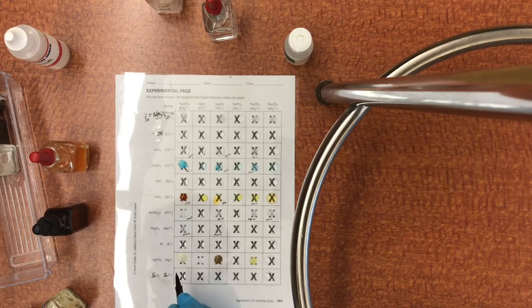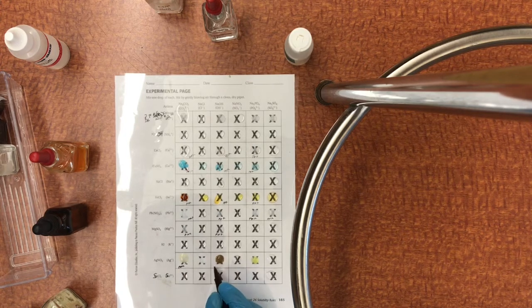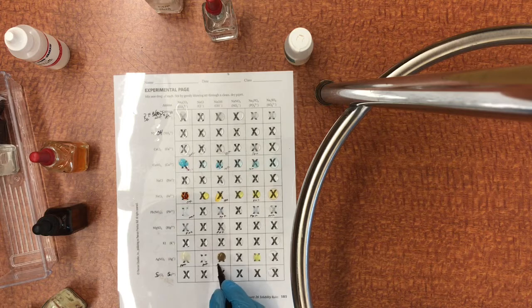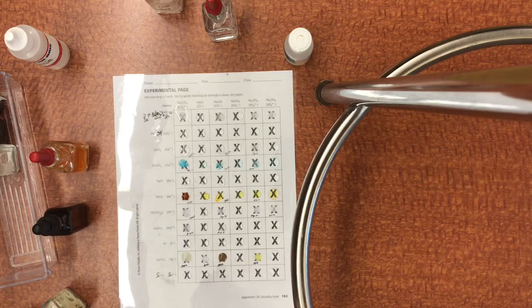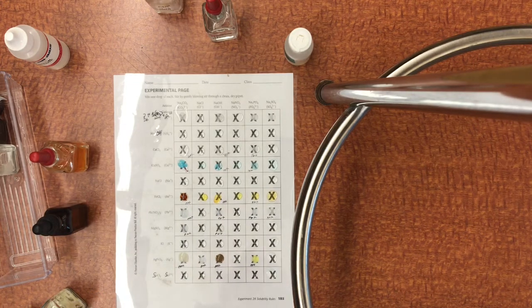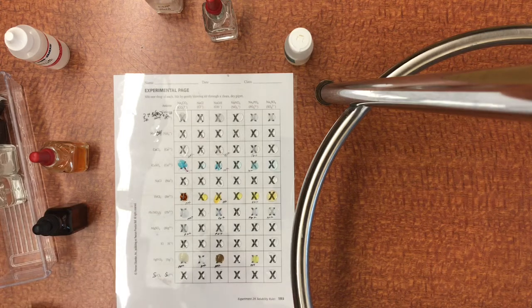So these different solids, they actually will deflect light in different ways or interact with different photons and they'll become colored crystals. So a lot of different ways that color can come in crystals. That's really beyond the scope of what we need to talk about, but it's usually related to either scattering of the light, or in this case, these are tumbling around in water, so it's probably more that the bonds themselves interact with certain wavelengths of light, leaving certain colors.